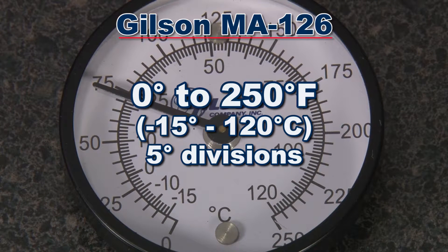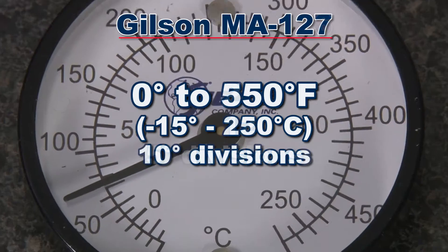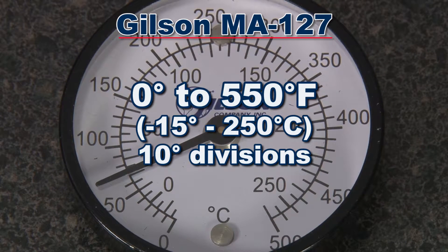The MA-126 has a temperature range of 0 to 250 degrees Fahrenheit with 5 degree divisions. And the MA-127 has a temperature range of 0 to 500 degrees Fahrenheit with 10 degree divisions.